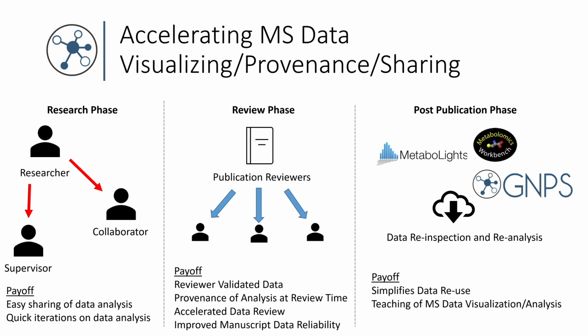And then finally, after publication and the data is deposited, what this enables is easy data reuse. You can go to any repository, find any file, and visualize it within seconds. So this obviously makes it nice if you want to mine other people's data for corroborating evidence, as well as it facilitates teaching. You can look at data across multiple different instrument vendors and see similarities and differences.